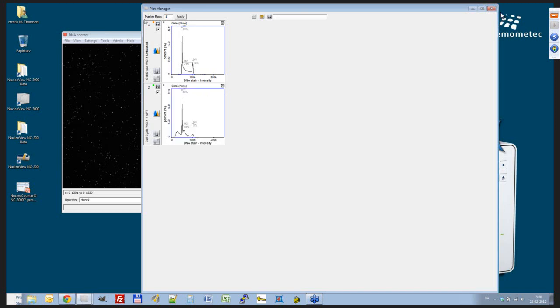And we can see a lowering of cells in S phase and G2 phase, and that is because we have a hole in the S phase, so the cells going through S phase into G2 phase will be lowered, and that is what camptothecin does.